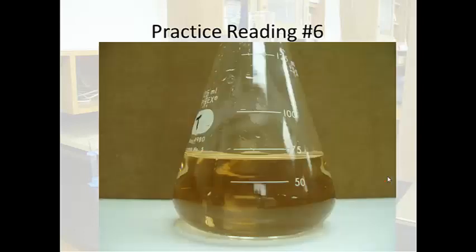Finally, reading this, this is an Erlenmeyer flask. Notice it's a little bit different reading an Erlenmeyer flask. The distance here is a measure of 25 milliliters. And the distance here is a distance of 25 milliliters. Notice those two distances are not the same. This probably isn't a very good tool if I want an exact measurement for both the reason that the increments are in 25 milliliter increments, and also because I really can't tell very well what the distance is going to be for a precision measurement here.